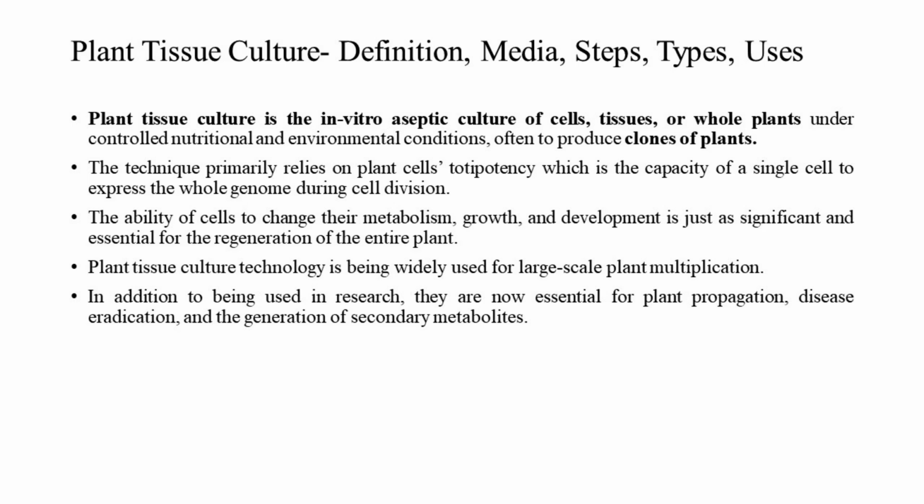Plant tissue culture definition, media, steps, types, uses. Plant tissue culture is the in vitro aseptic culture of cells, tissues, or whole plants under controlled nutritional and environmental conditions, often to produce clones of plants.